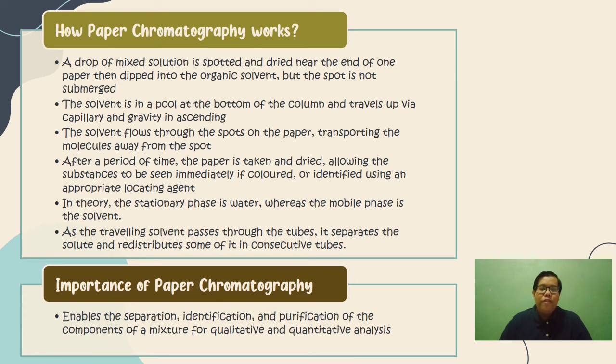The paper chromatography method also allows us to perform lab work regarding a mixture, and that enables the separation, identification, and purification of the compounds and components of a mixture for qualitative and quantitative analysis.